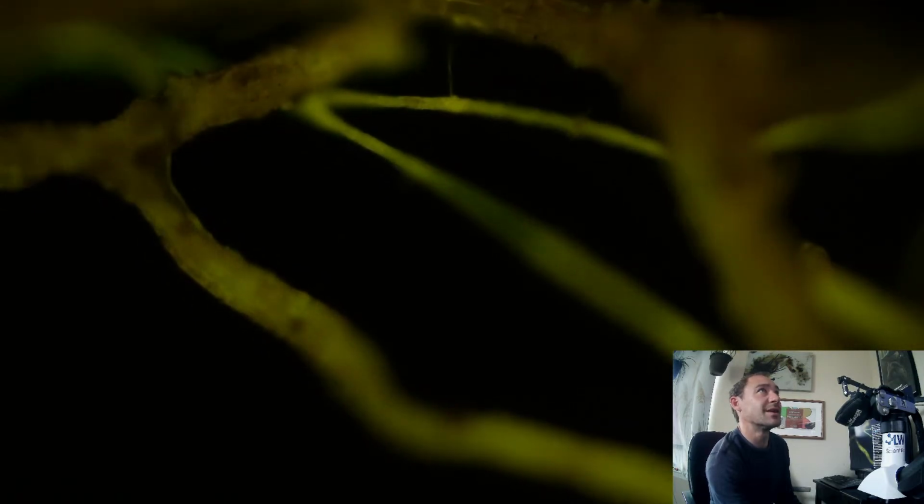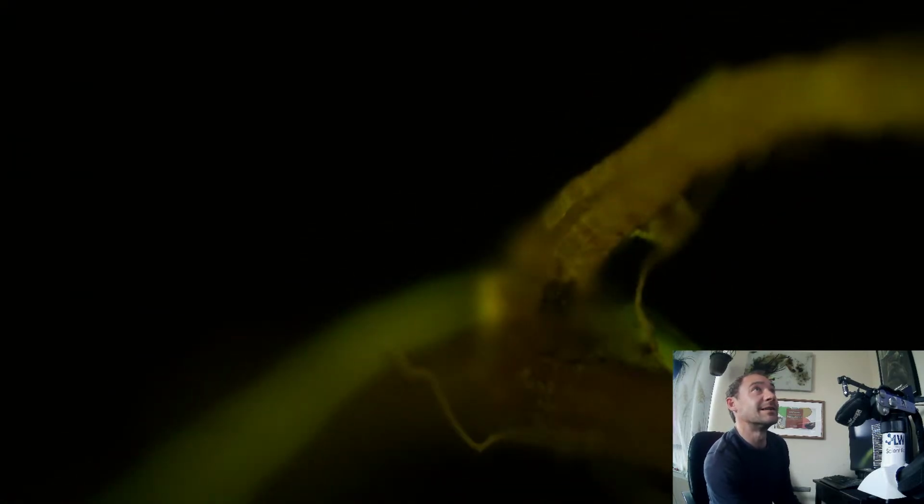I wish I could find one more equal in size to the other ones. I thought it was equal size, but it's actually just twisted, like a rope, leading me to believe that it was much bigger than it is. But all the hairs are glowing super bright. All right.